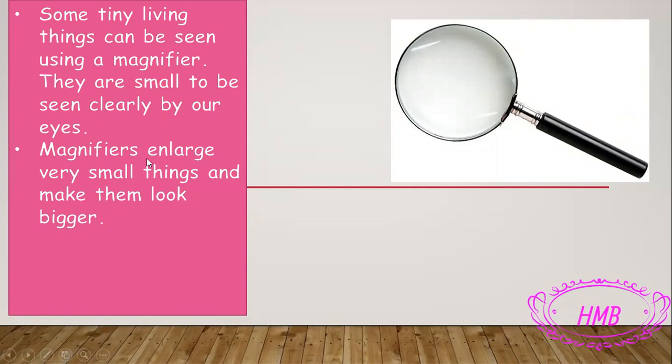Magnifiers, why do we use them? We use them because they enlarge very small things. So we use them to enlarge small things and make them look bigger. This is the purpose of using these magnifiers, the magnifying lenses, or simply the magnifier.